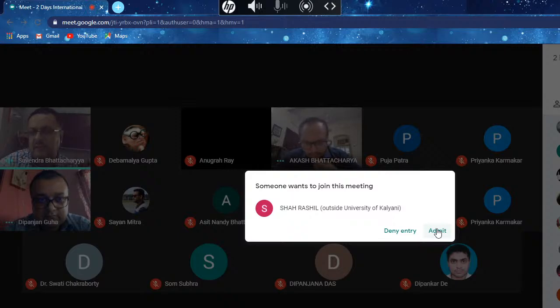But we use that when we do this kind of image processing. And this Imaris platform is a very good platform to do this kind of analysis. The images can be obtained with almost all types of confocal platforms, like Zeiss, Leica, Andor, Olympus, it doesn't matter. But the image will be processed in third-party software, in this case Imaris, and you can get this image.